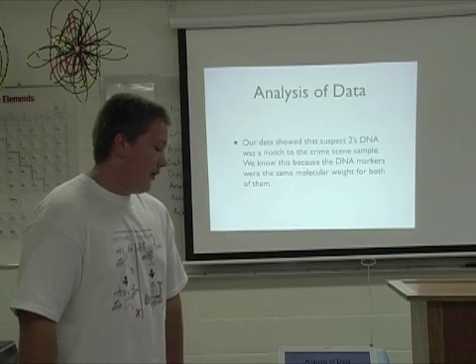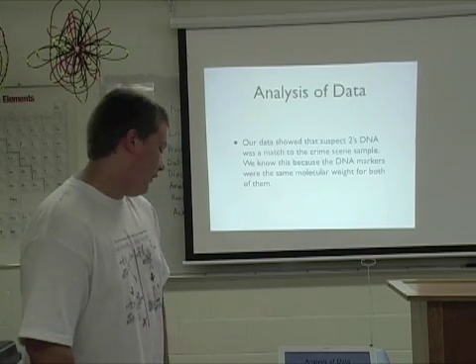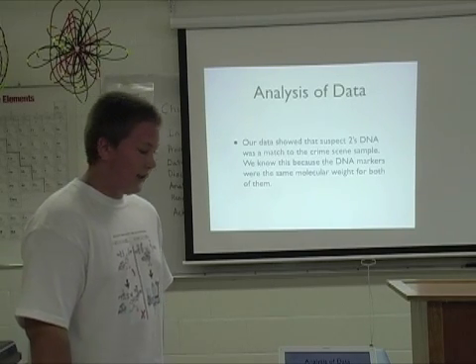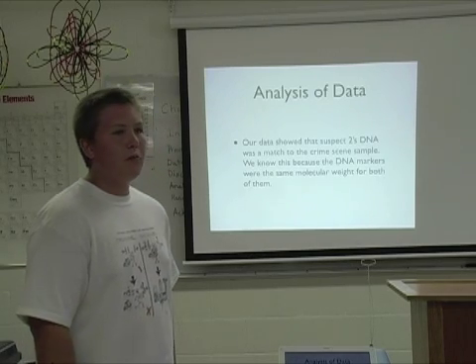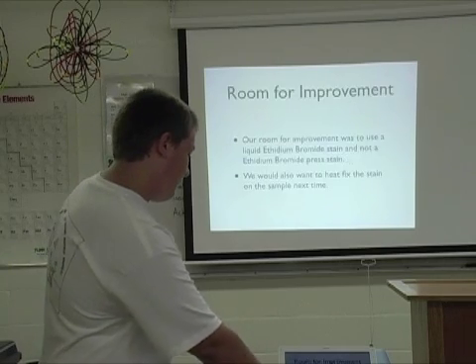And our data showed that suspect 2's DNA was a match to the one collected at the crime scene. And we know this because the DNA markers that ended up on the electrophoresis were the same molecular weight for both of them, which just means they traveled the same length and matched up.